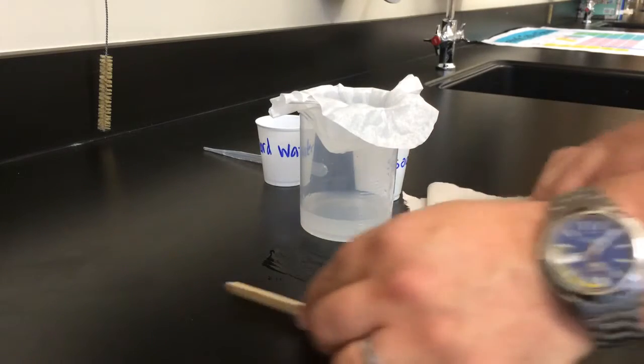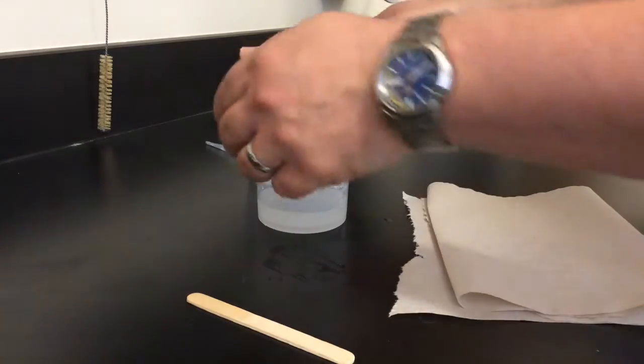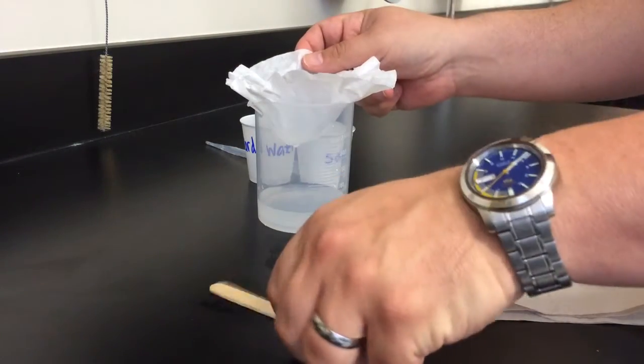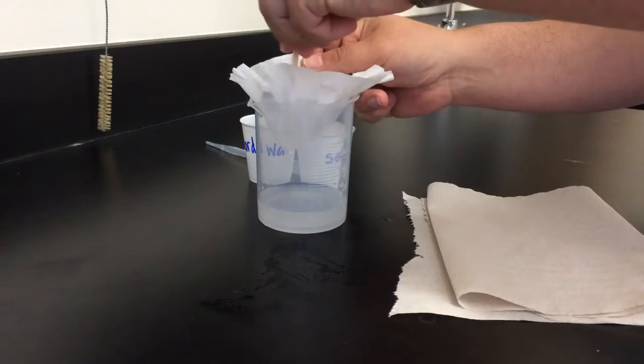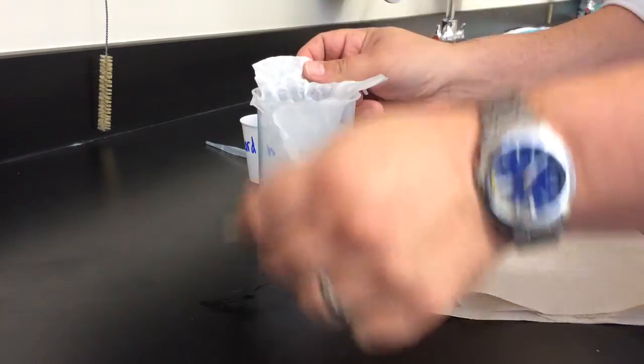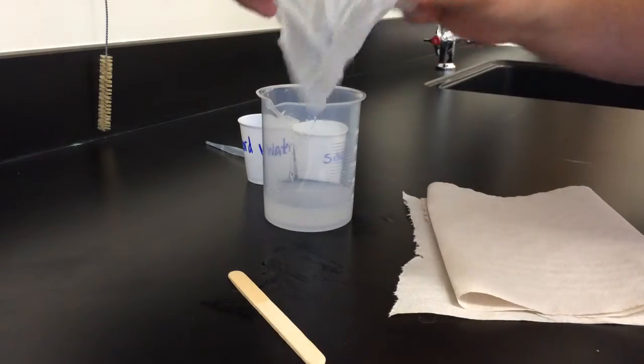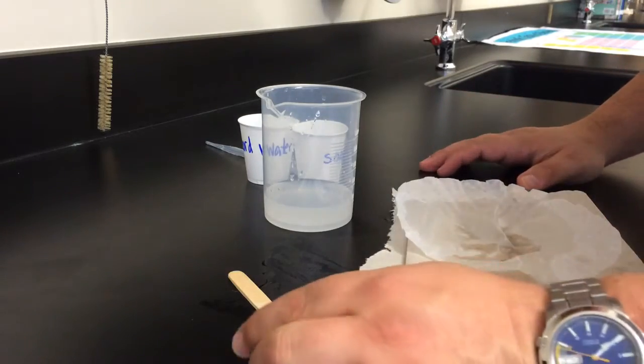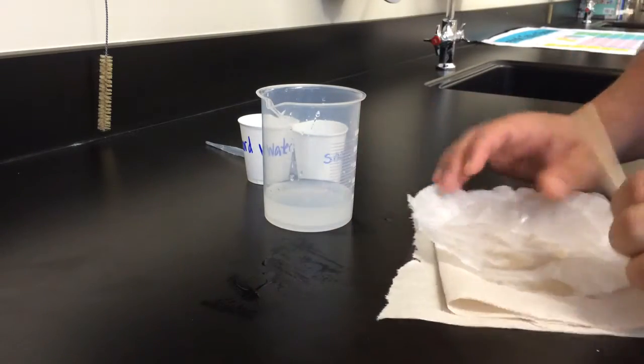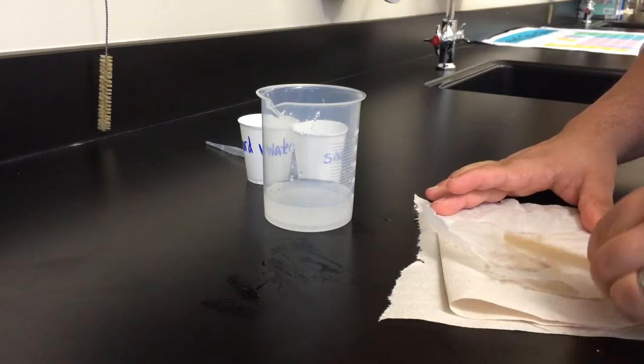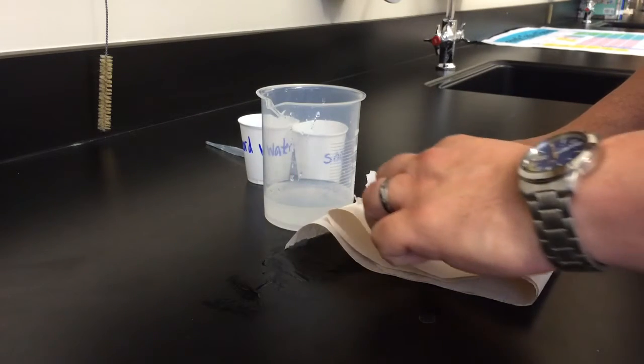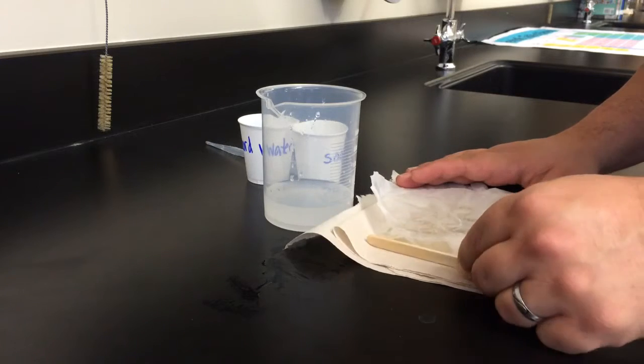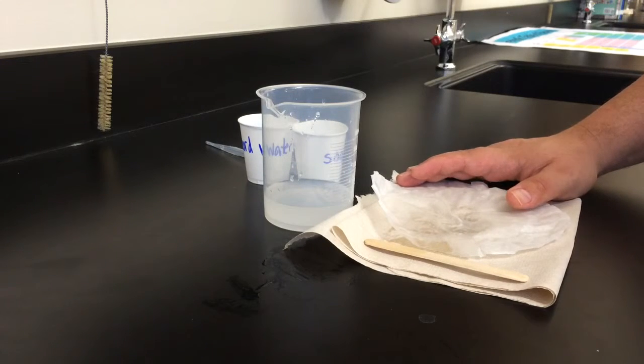And then the last step, once I've got it pretty much water free, as dry as I can make it, is to lay the coffee filter out and start to let it dry but gently scraping it with the popsicle stick and I'll bring together a little bit of white stuff and that's my soap scum.